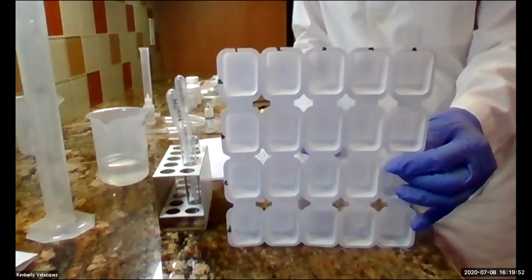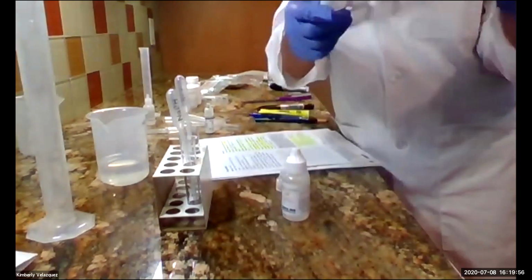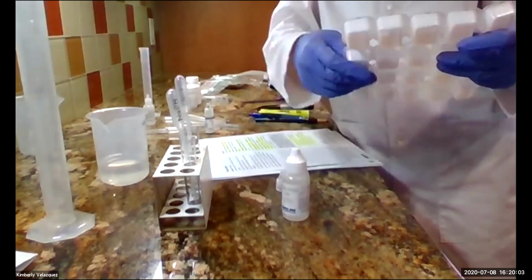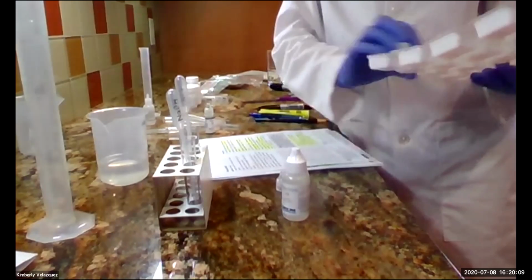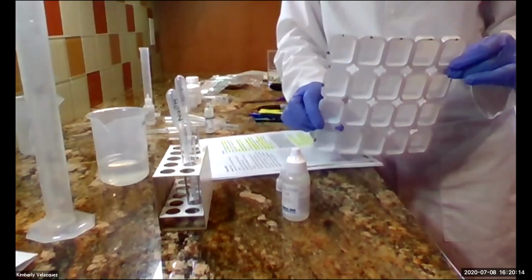Each one of these wells is going to end up with something different in it. You also want to make sure that there are no holes in your tray. I had to go through it and press out the wells because some of them were bent from shipment. So really make sure you go along and press this in. Make sure you have some really nice well-shaped wells for doing your experiment.